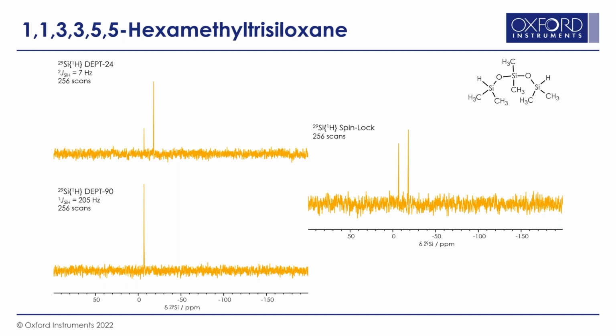A sequence which we haven't seen so far is the spin-lock polarization experiment. This shows all silicon signals coupled to one or more protons without the need to select specific experimental parameters, as was done with the DEPT series.